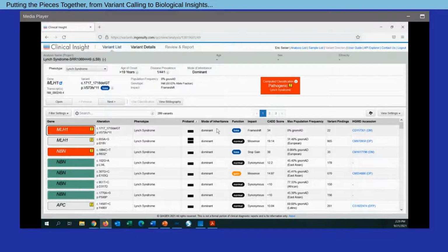We'll have its most common mode of inheritance, again, defined by what we know in the literature. We'll have information relating to the functional impact. We can see here that this variant, I'll focus on the GT deletion, that's a frameshift mutation. We also have another pathogenic mutation in NBN, and that's a stop gain. We'll also have other information related to impact prediction. The CADD score here we can see is very high for these two pathogenic variants. We can also look at population frequencies across variant databases. And lastly here, we'll have the HGMD information in the final column.